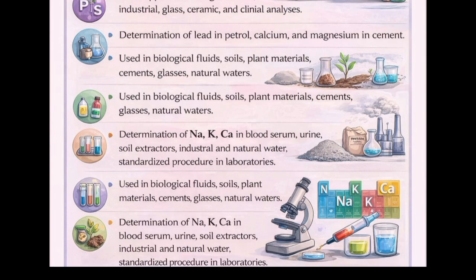FES detectors for P and S are commercially available for use in gas chromatography. FES has found wide application in agricultural and environmental analysis, industrial analyses of ferrous metals and alloys, as well as glasses and ceramic materials, and clinical analyses of body fluids.